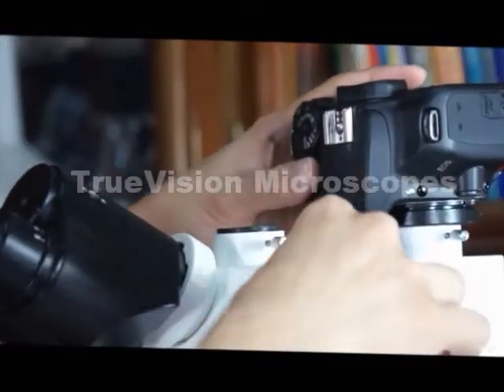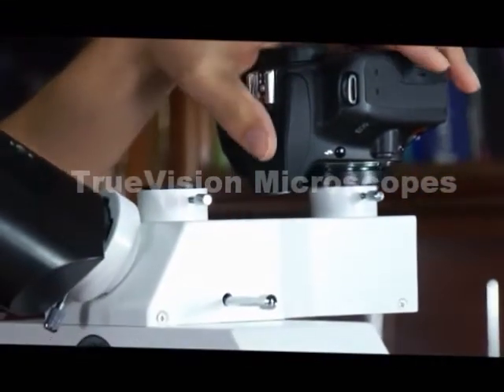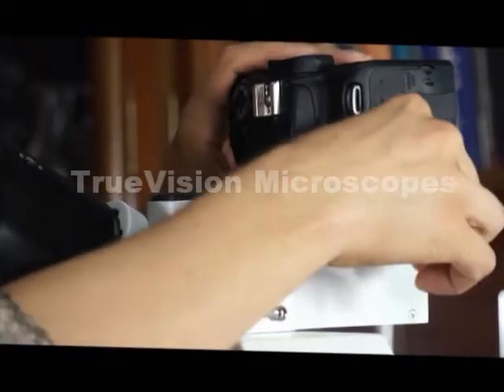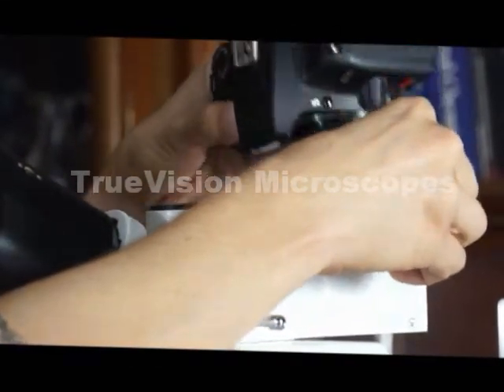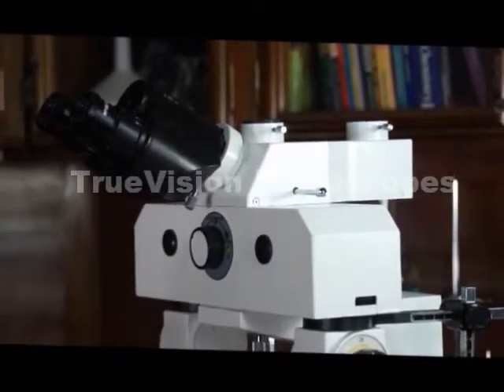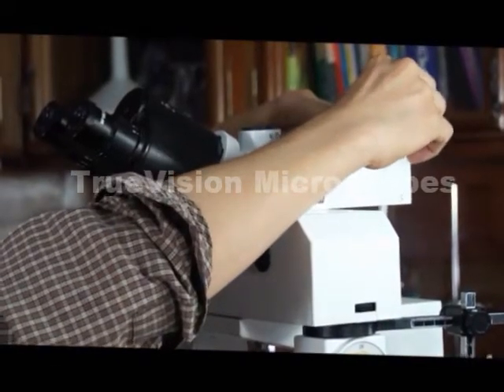At this point, we pull the light diversion knob out and now we can take photography with our DSLR camera. I'll cap this port — you want to keep them capped so you don't get dust in them.